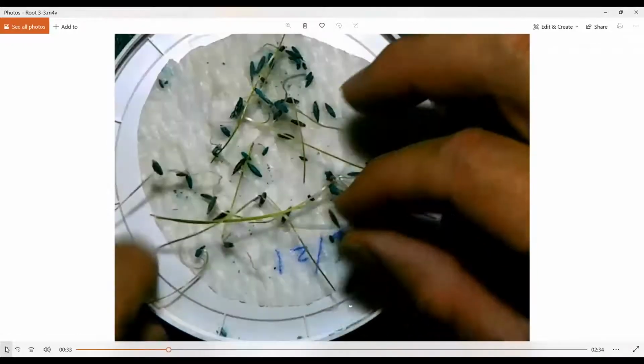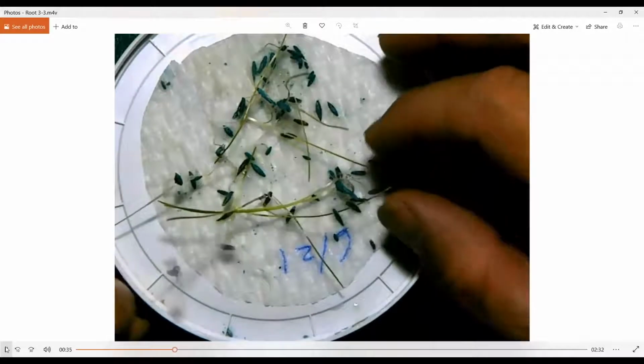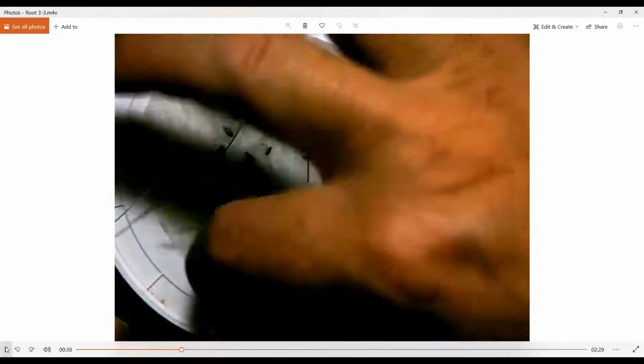But when I started looking at them with the projector, I realized the projector magnification was not high enough for me to show the details that I want. So I'm going to show those details under the microscope instead. So we're going to be describing the structure of the root tip here using the grass, which is a monocot. We're going to see similar features in dicots, and we'll talk about the internal structural differences between dicots and monocots later on. But if you look at the figure in the lab manual, it should show these characteristics that we're going to be talking about.